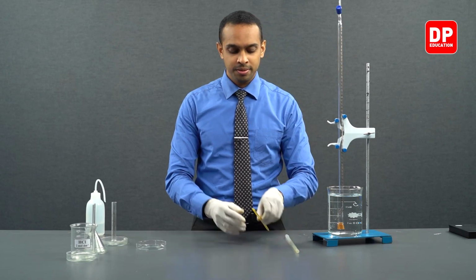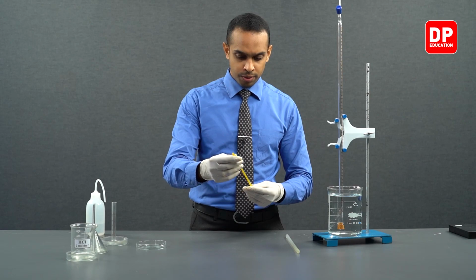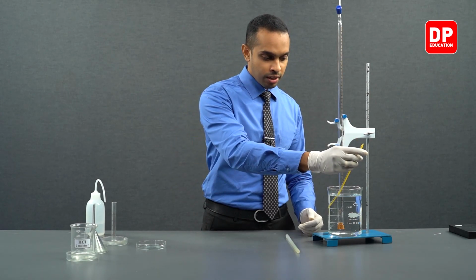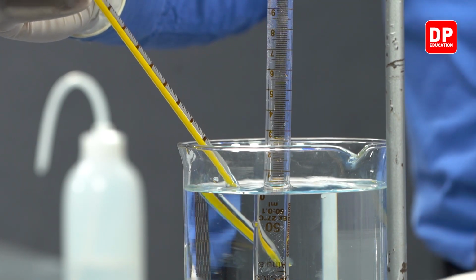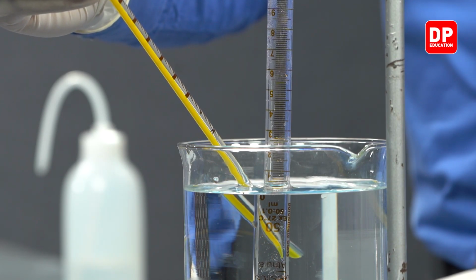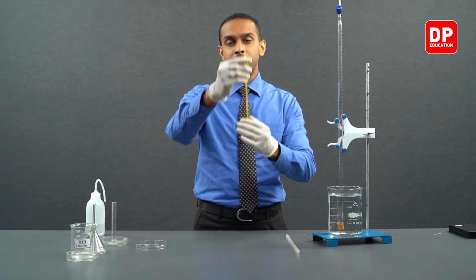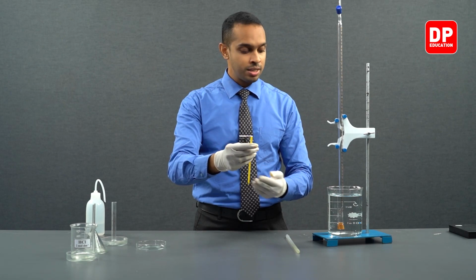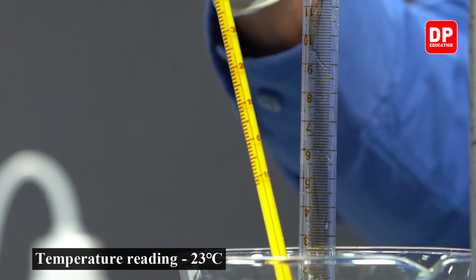We have our thermometer here. We'll place it inside this beaker and let's observe the temperature reading of this water. Just like in the previous trial that we did, the temperature of this water is 23 degrees Celsius.